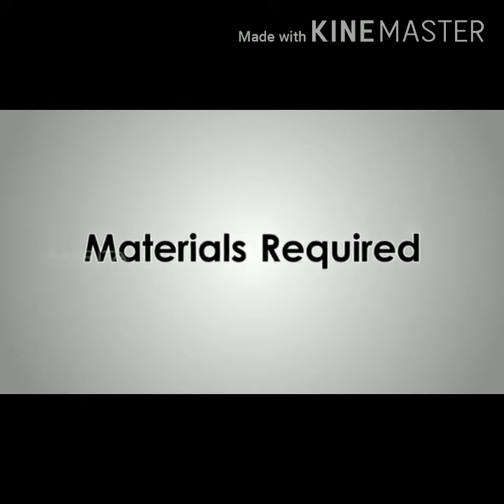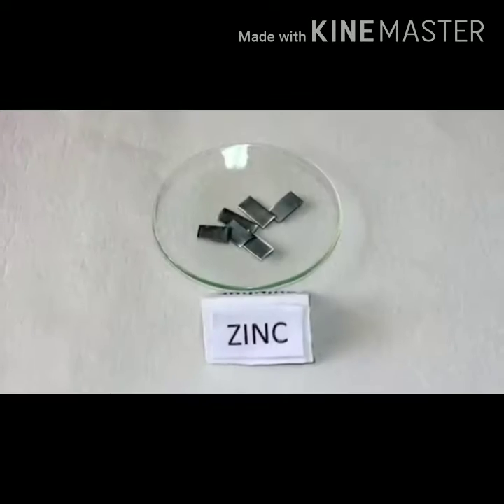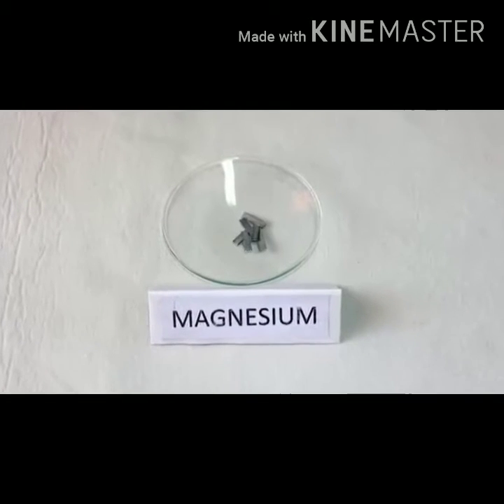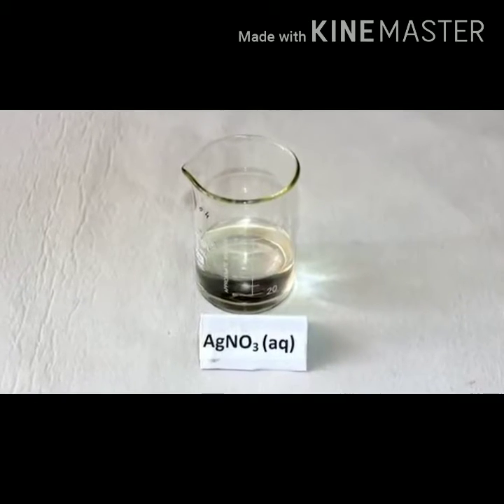Materials required: small pieces of iron, copper, zinc, magnesium, aqueous solution of copper sulfate, zinc sulfate, aluminium sulfate and silver nitrate.